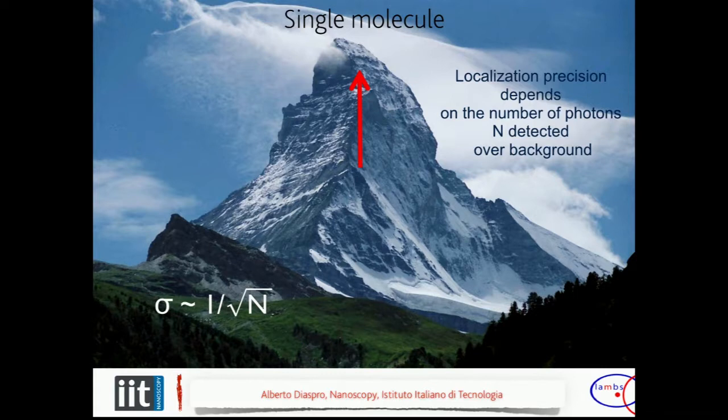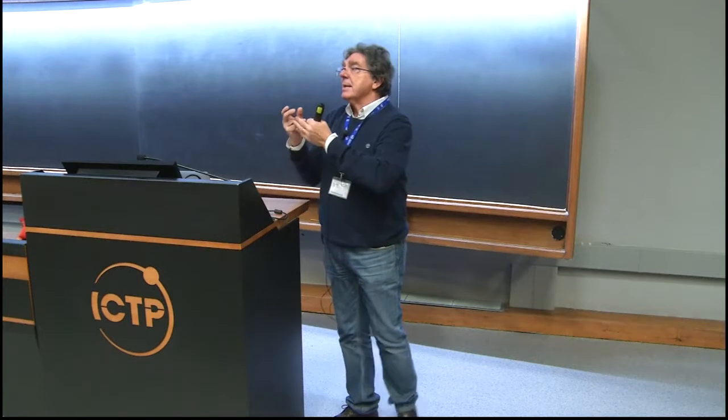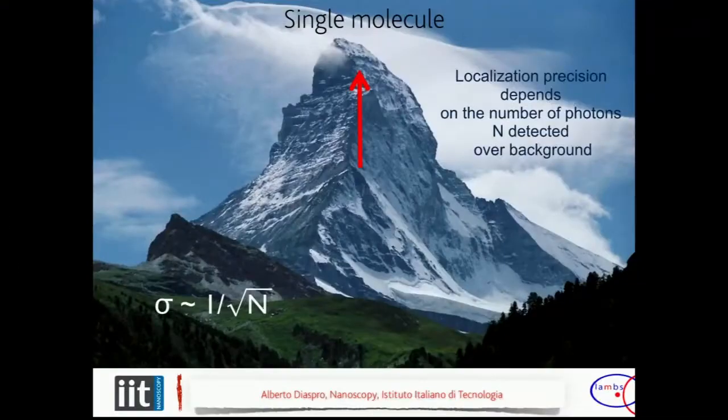Now, with single artificial fluorescent molecules, green fluorescent molecules, it is relevant to try to understand something about the behavior of single fluorescent molecules. Because when we are dealing with a single molecule that is emitting, we can improve our ability in localizing this molecule, thanks to the number of photons emitted. It is as if the protein is singing: the amount of sound comes from a single molecule that is the only one talking to you time by time.